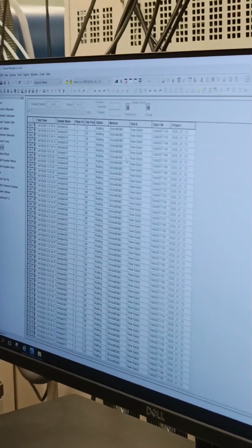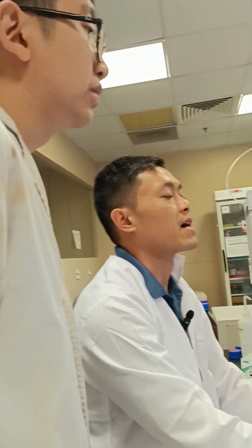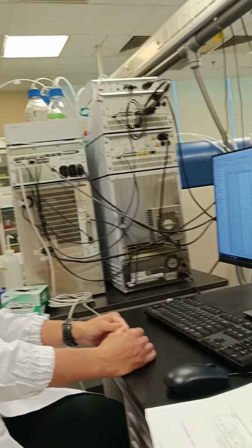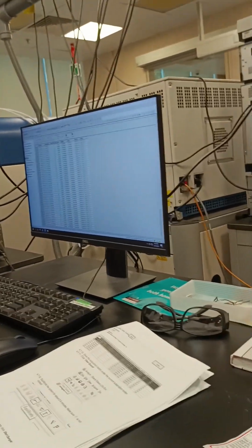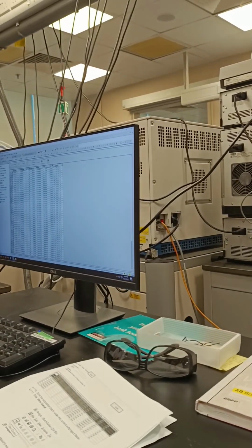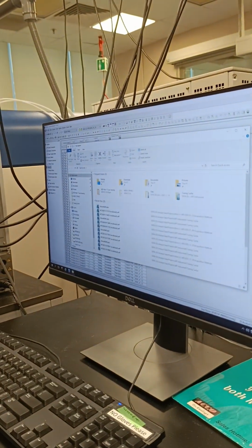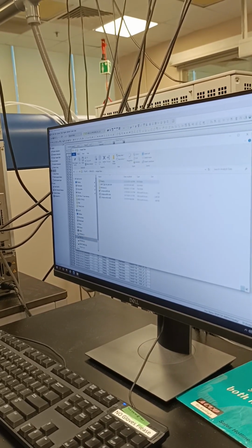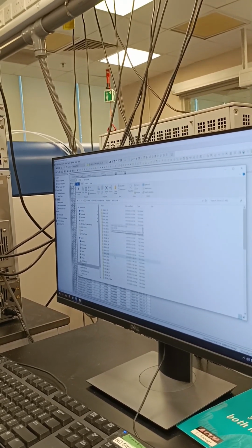If you never do the quantification, how will you know your sample? Because I'm just doing screening. Oh, okay. I'm just doing metabolic screening, but I'm not doing any targeted metabolomics so far. What does your result look like? Oh yeah, I will show you guys as well. Yeah, of course. So while this is running. Because I want to know if I can get away without doing the quantification. Okay, fair enough. I just do it myself using. You can in a way, but I'm not sure how to do it.